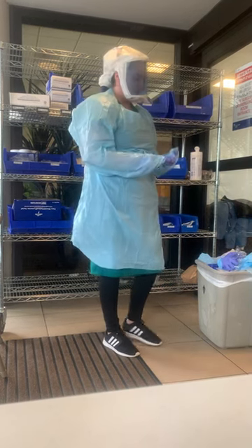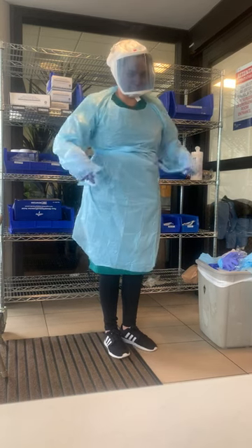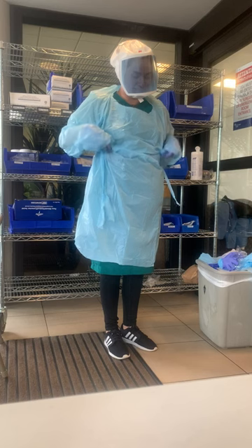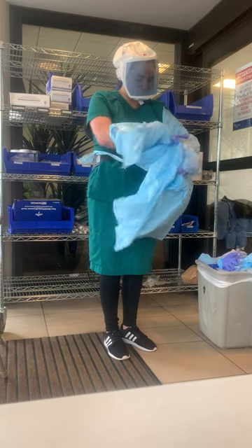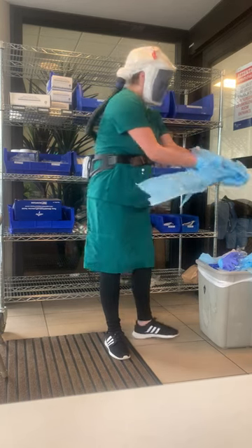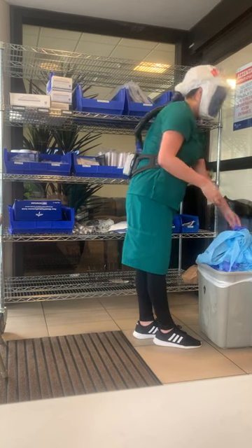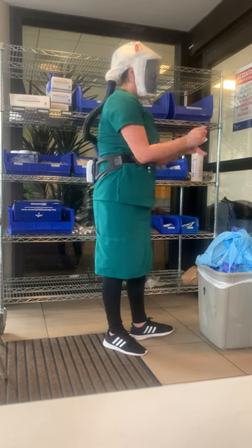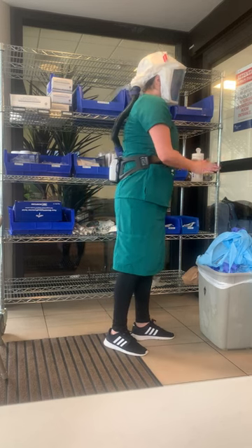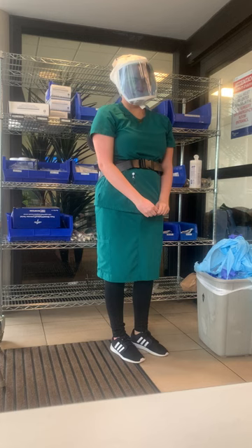Remove isolation gown while removing inner gloves. Perform hand hygiene. At this point you will exit the patient room — for the purposes of this demonstration, we have exited. Perform hand hygiene again.